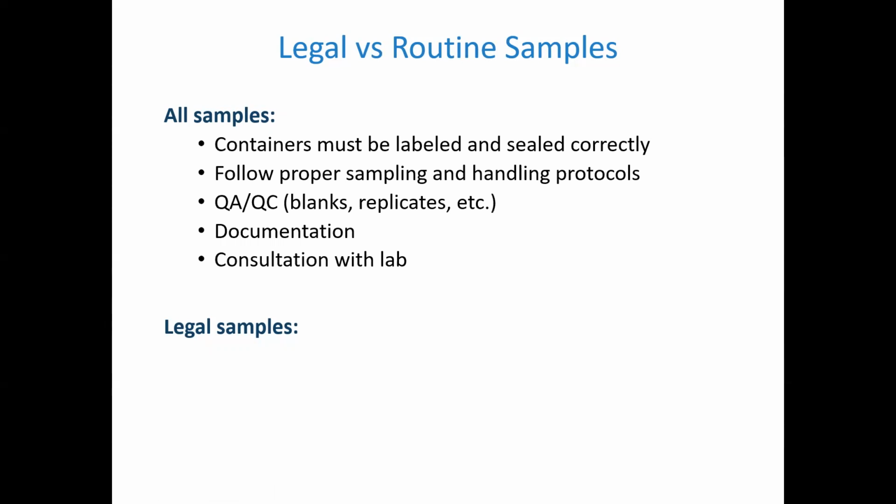You don't want to have to find out that you were supposed to have done a pH measurement in the field and you didn't do that, right? Don't want that to happen. But some samples are what we call legal samples, okay? And a legal sample basically means something that may have legal repercussions.